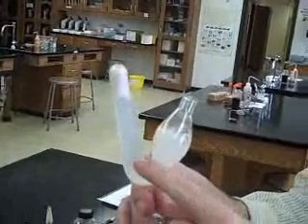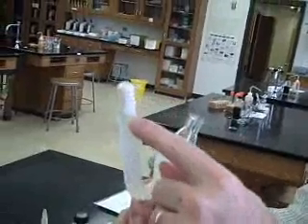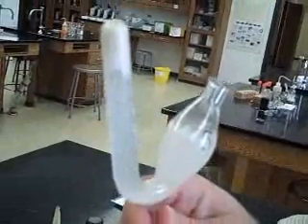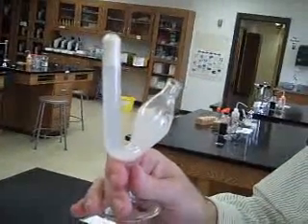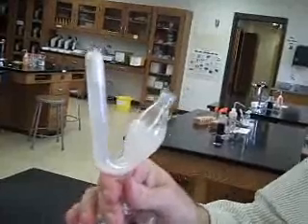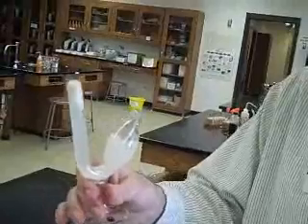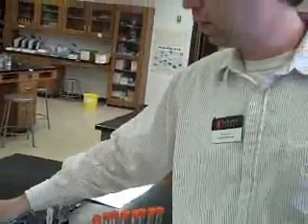When they did alcoholic fermentation, they produced carbon dioxide gas as a byproduct, and the bubbles get trapped in the tube, and we were able to measure how many milliliters of gas was produced in the tube. This one produced, looks like, about 2 1/4 milliliters of carbon dioxide gas. So that's a demonstration of fermentation by yeast. And you should know all about lactic acid fermentation and alcoholic fermentation from reading your manual.